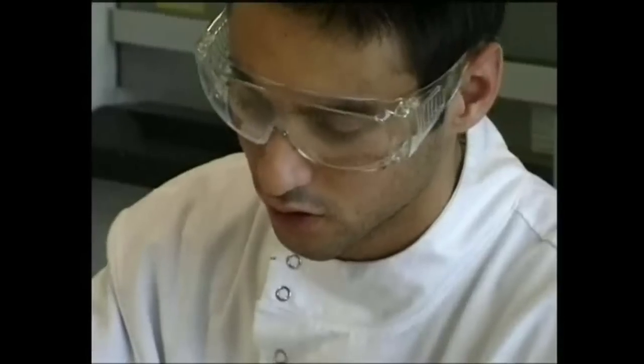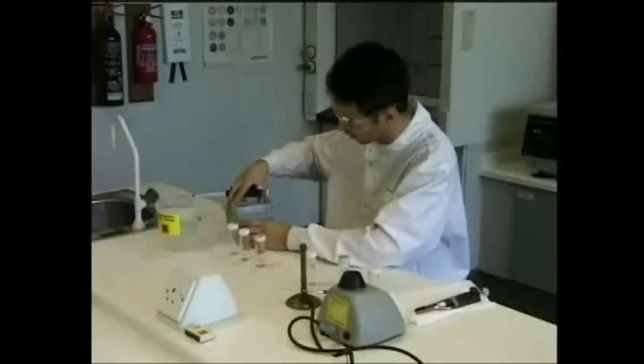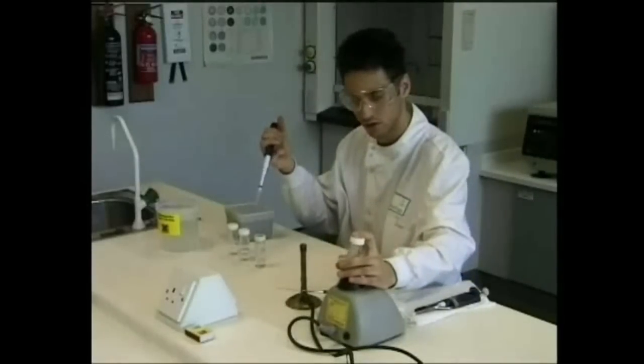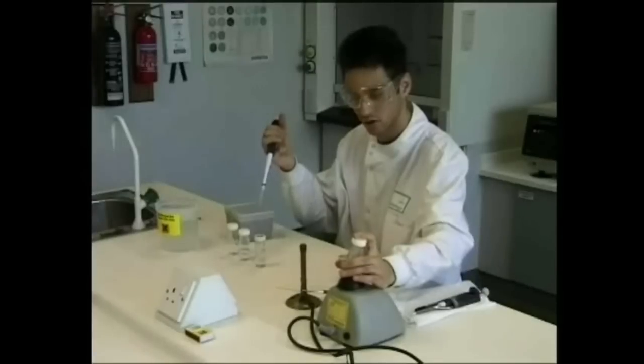This video gives information on the safe handling and manipulation of microorganisms using basic techniques, and a couple of examples of more sophisticated experiments are also mentioned.